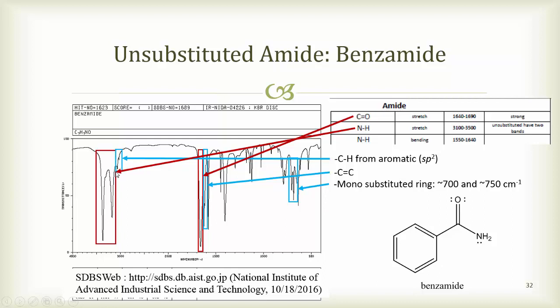I really don't see it well defined here at all. I'd probably miss it if I were a student because it's just not well defined. But you do see the carbon-carbon double bond right here.